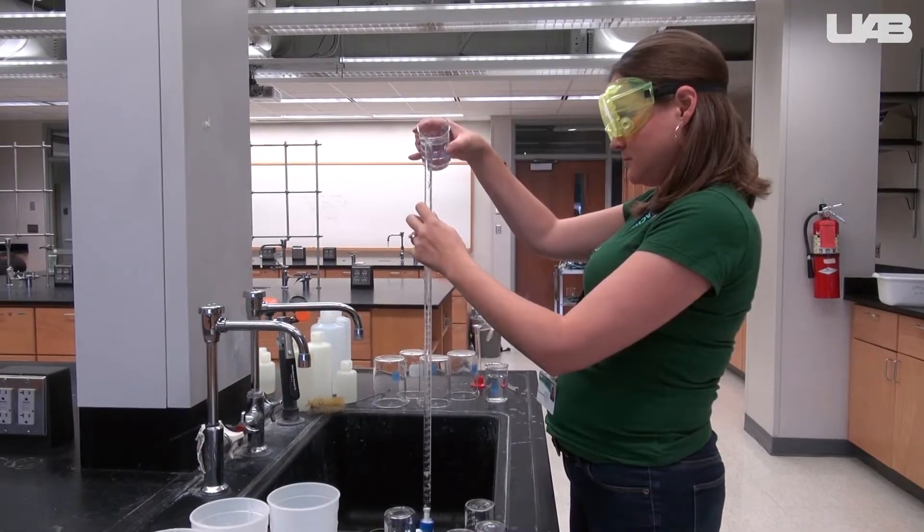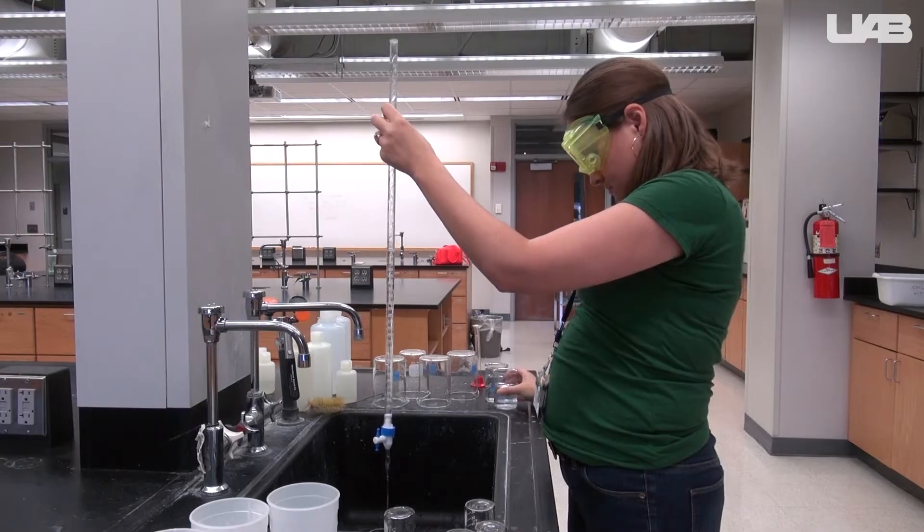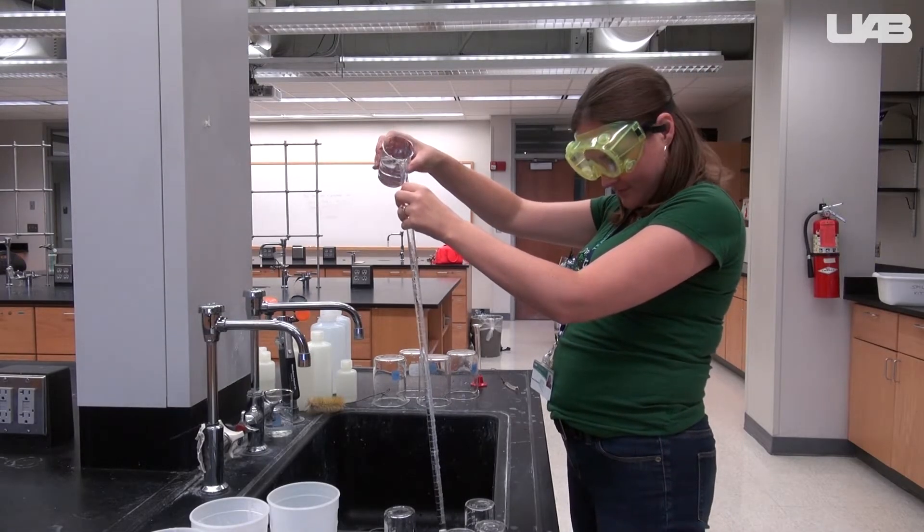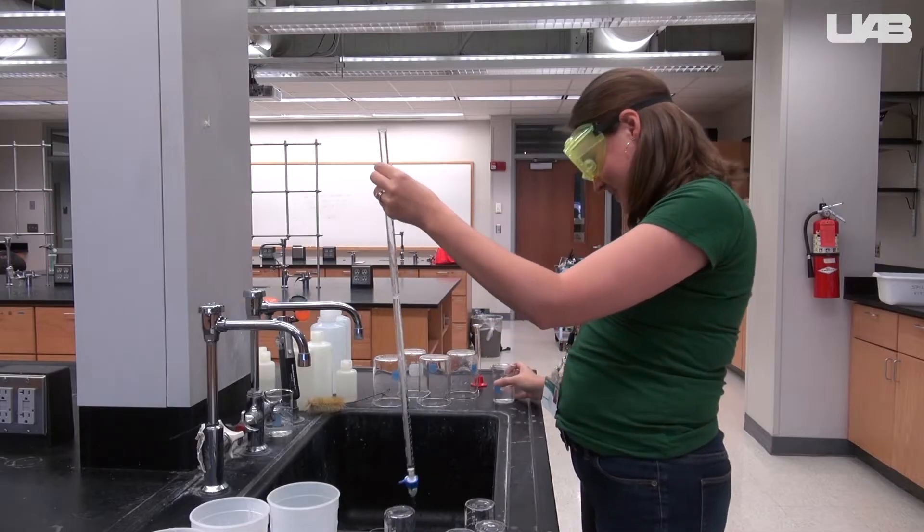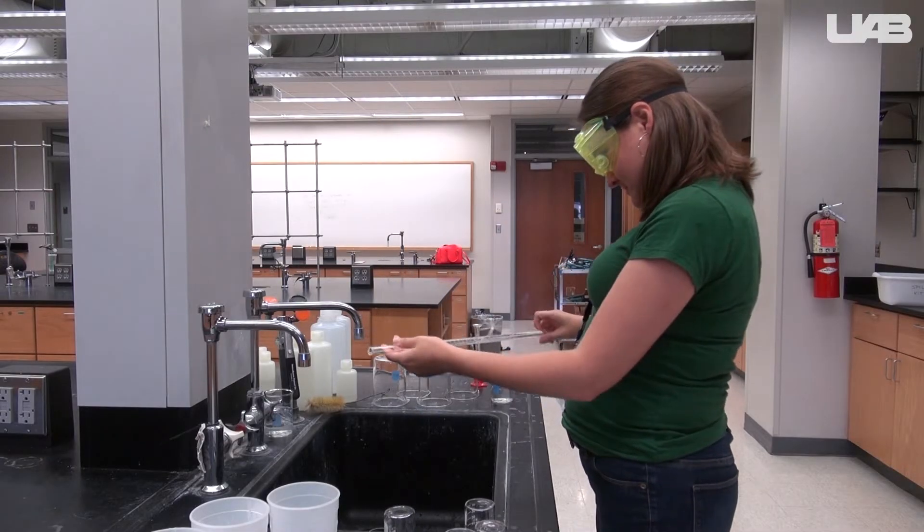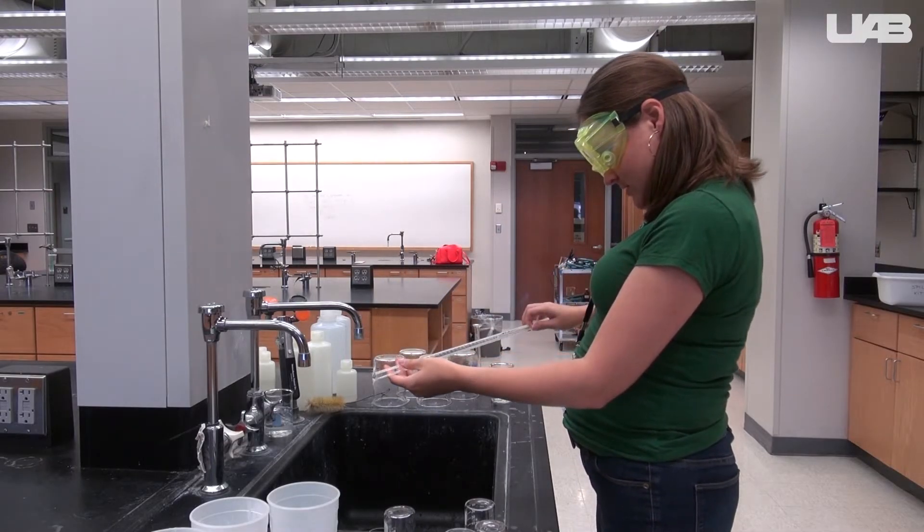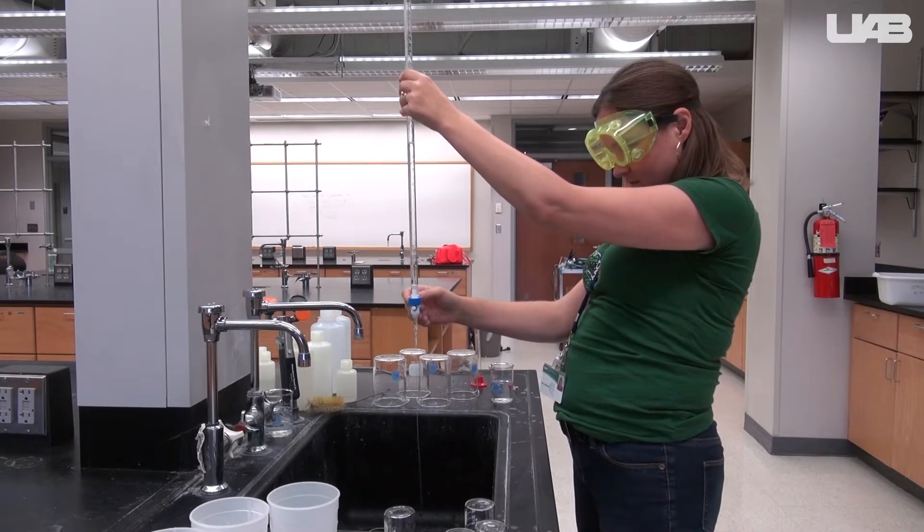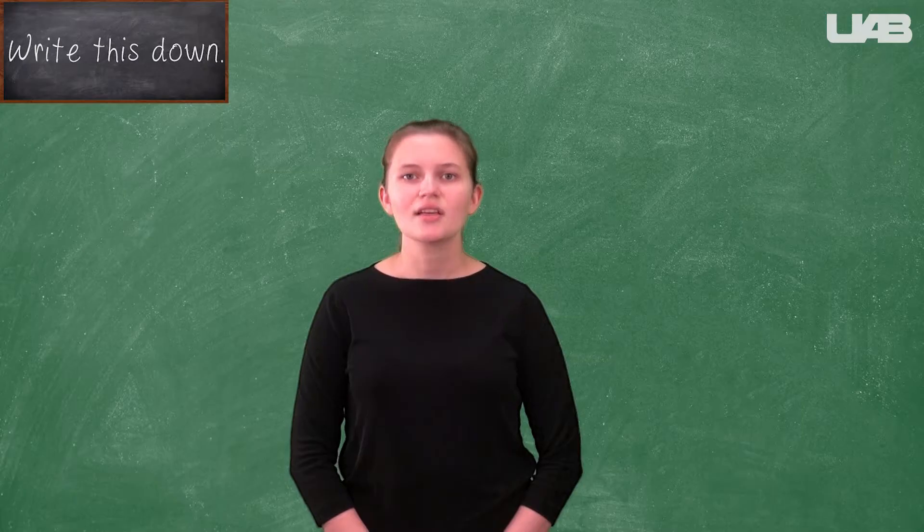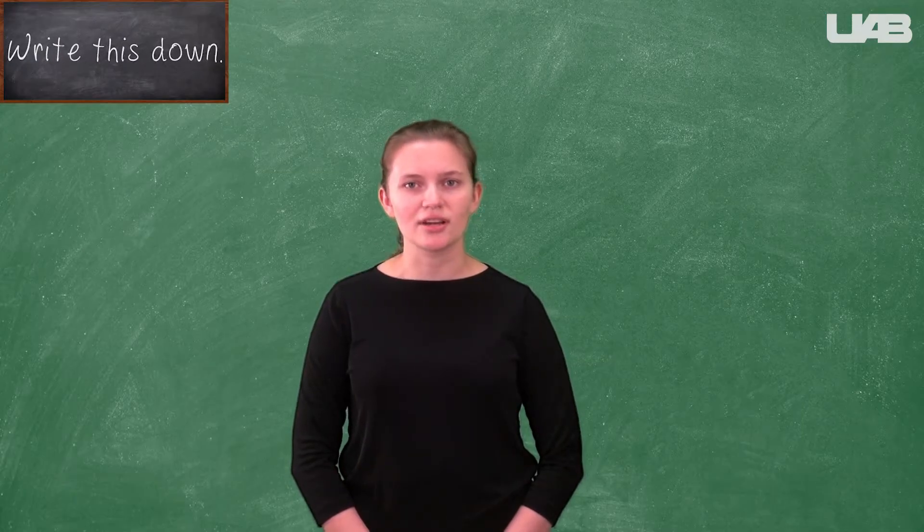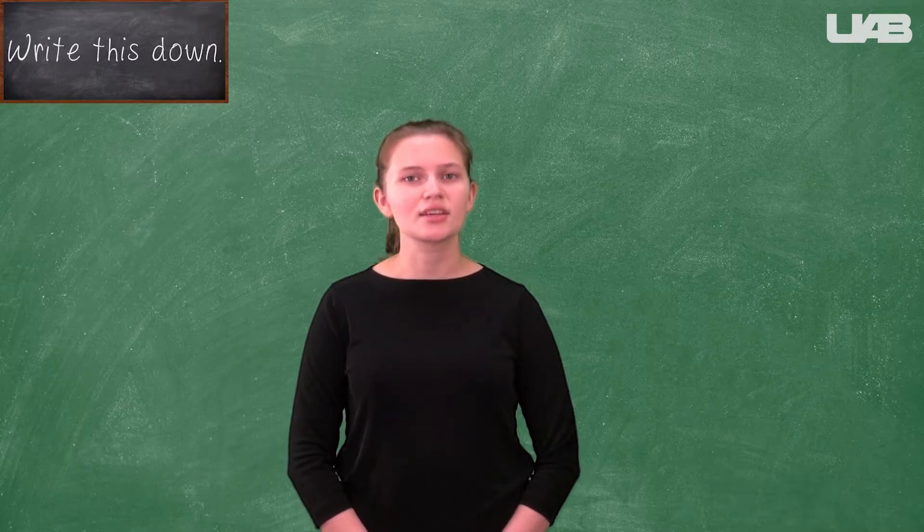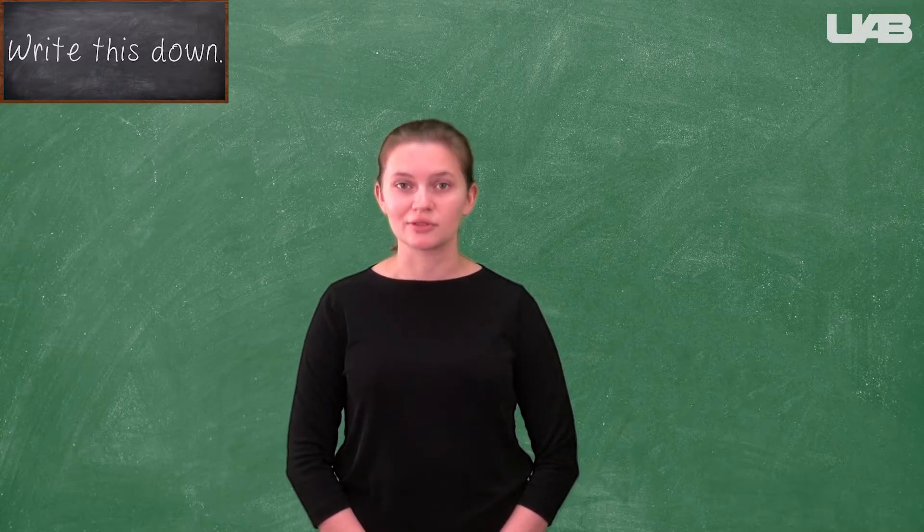To prime the burette, you must first rinse out the burette with water, then add a small amount of the sodium hydroxide to the burette. Coat the inside surface of the burette by rotating the burette with the sodium hydroxide. Drain this small amount of solution through the tip and repeat at least three times. This will ensure that the concentration of the sodium hydroxide solution is the same for each trial, since any water used to clean the burette will have been removed in the rinses.